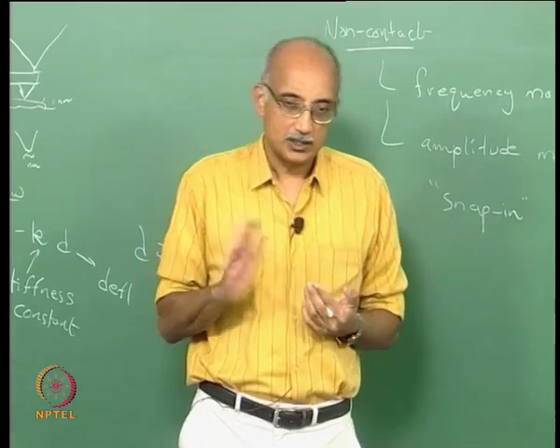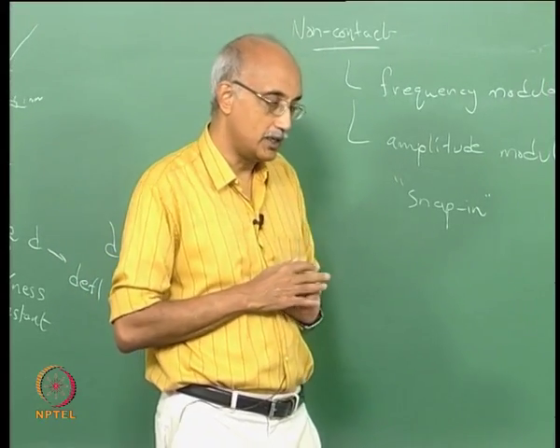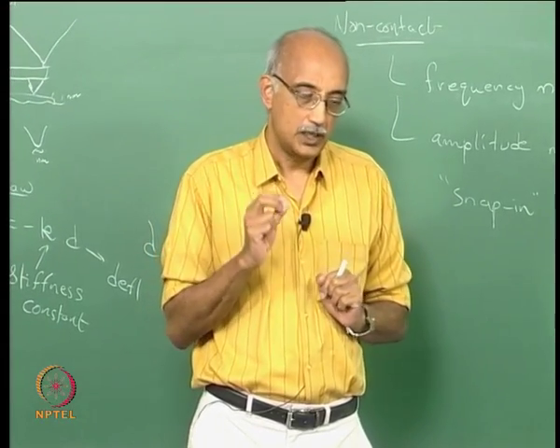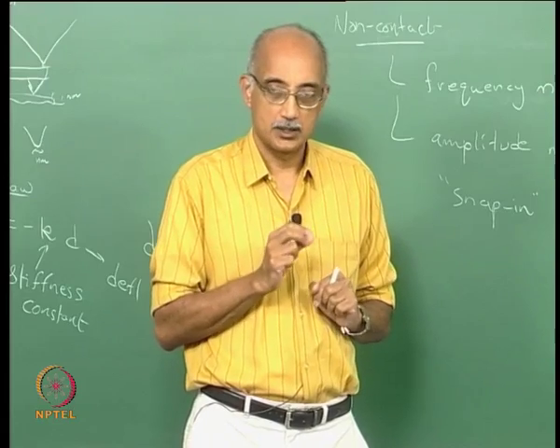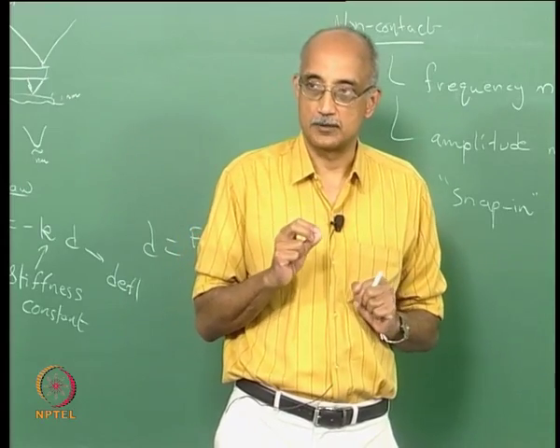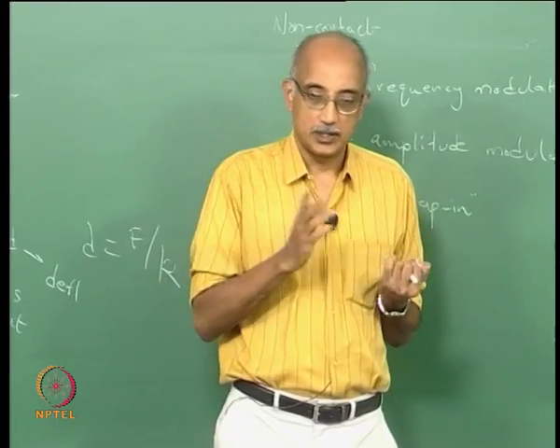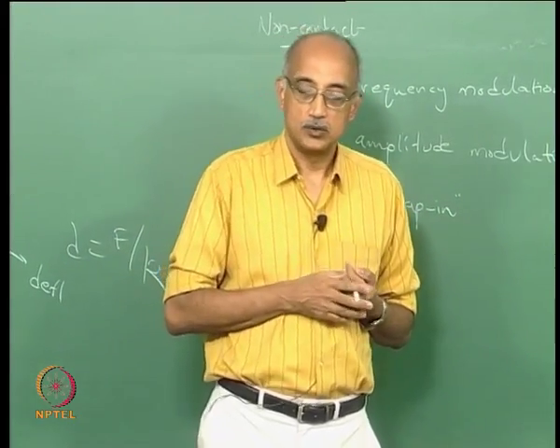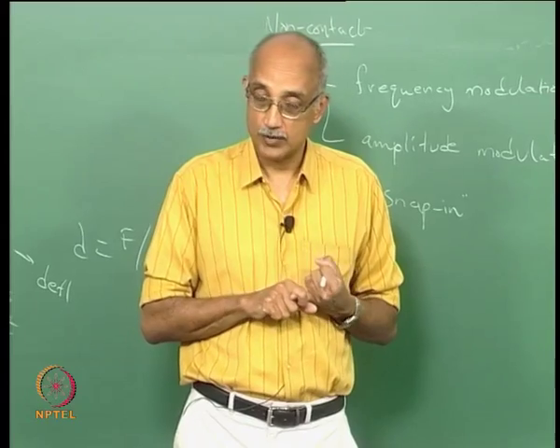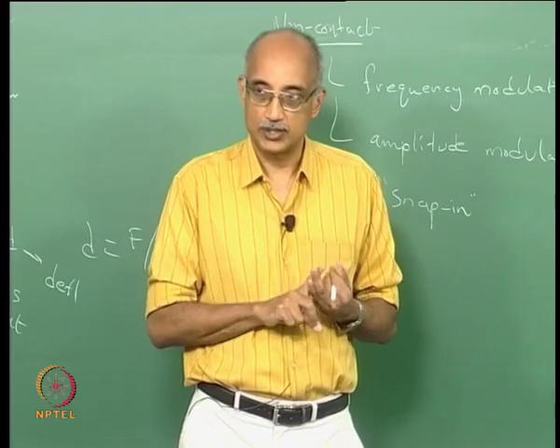XRD was invented in the 1920s actually, and the key finding was that a crystalline substance will reflect X-rays in a particular pattern called the diffraction pattern. And then there were 3 statements. The researcher's name was Hull, who essentially declared that all materials have a diffraction pattern, and he said each material has a distinctive diffraction pattern.